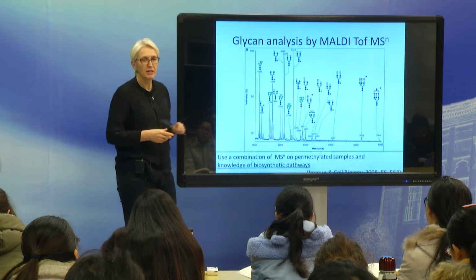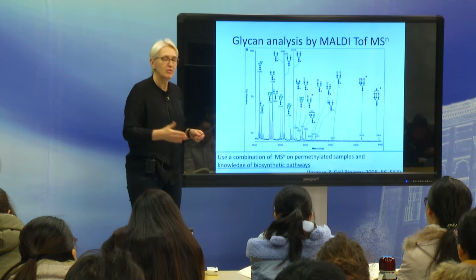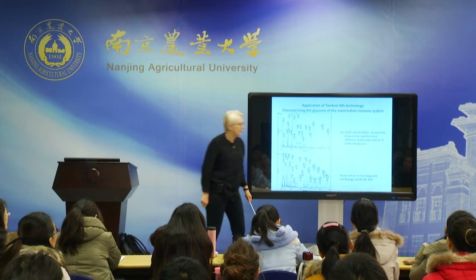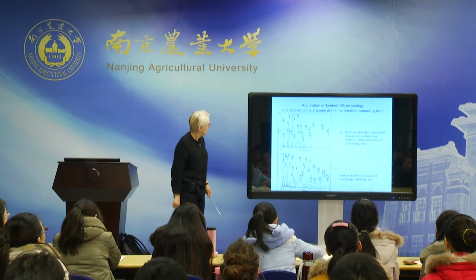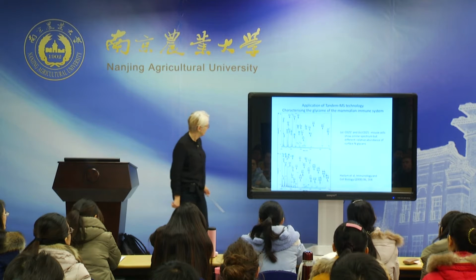It's not like LC in that case. So the previous method could actually quantify things. Here that's quite a bit more difficult. And just to show you sort of what experiments they can do, and this comes out of a 2008, not so recent paper, so they get a different analysis here.